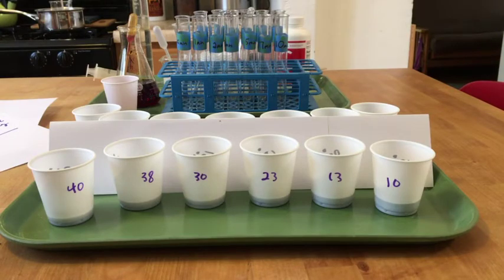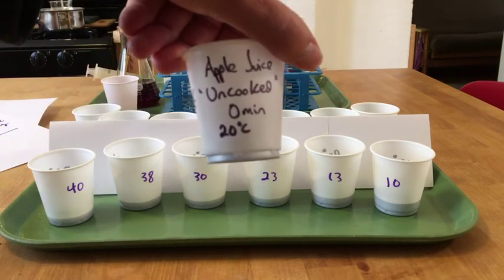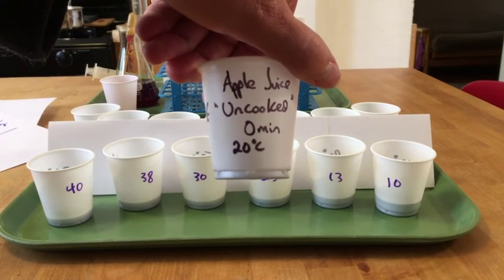What I'll do is next show you how to find the amount of vitamin C using those drops that you recorded here and the standard curve graph that you plotted, and then how to calculate what percent of vitamin C remains of the vitamin C that was in the original uncooked sample. Let's go upstairs and take a look at that.